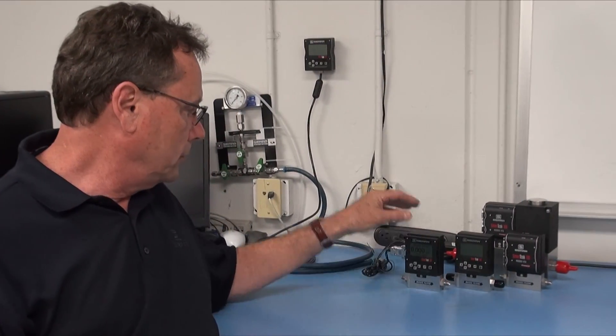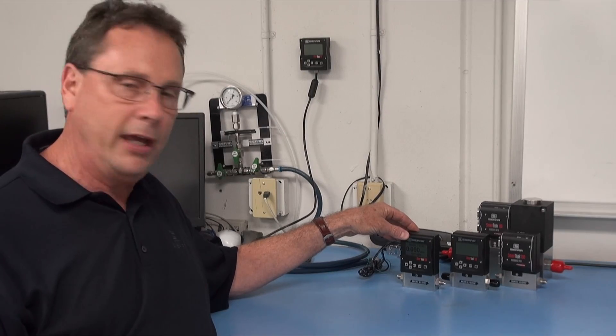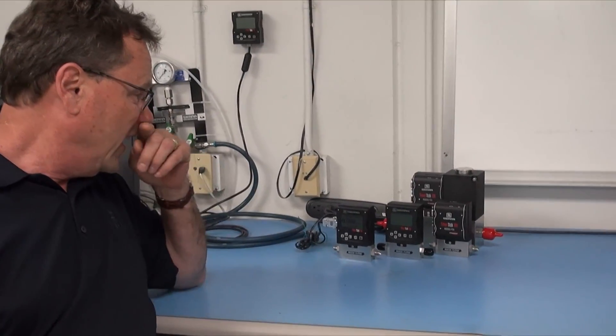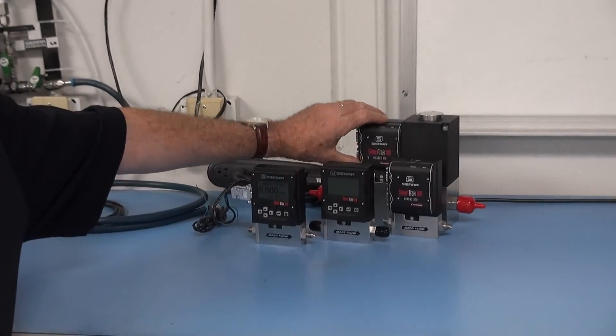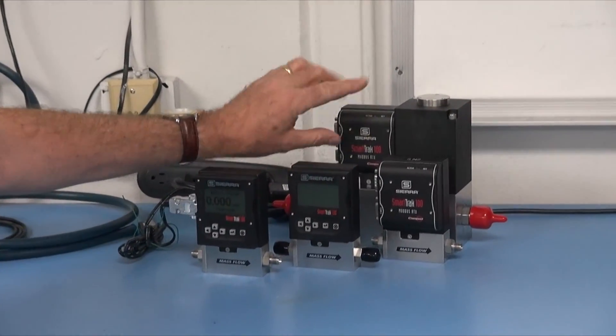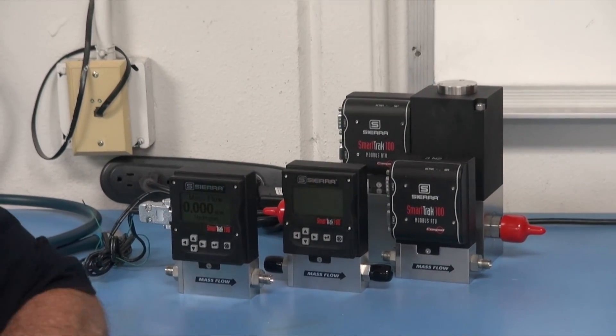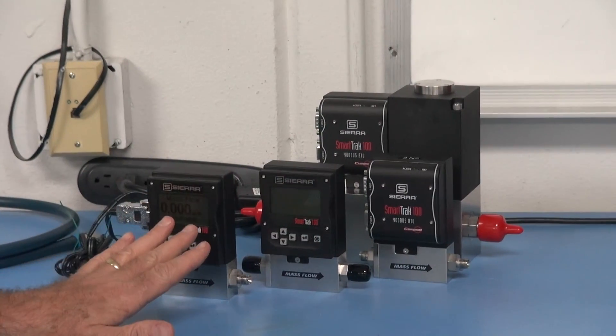What other features would you like to know about on these? Well, let me give you just a couple. You can, instead of getting the touchpad, you can get what this one has on the front. It's called a compod, and a compod is a nice little module that replaces the touchpad.